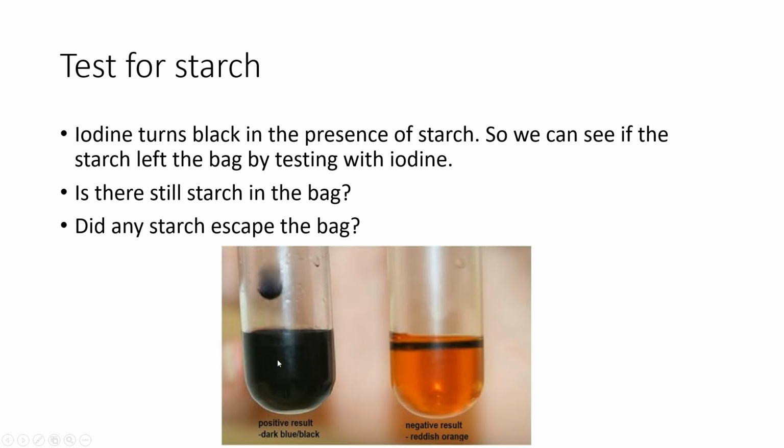Did starch diffuse from the bag into the beaker? No, because we did not get a positive result for starch in the beaker, so the starch could not leave the bag. For the why or why not, again, it's too large a molecule, it can't fit through there.